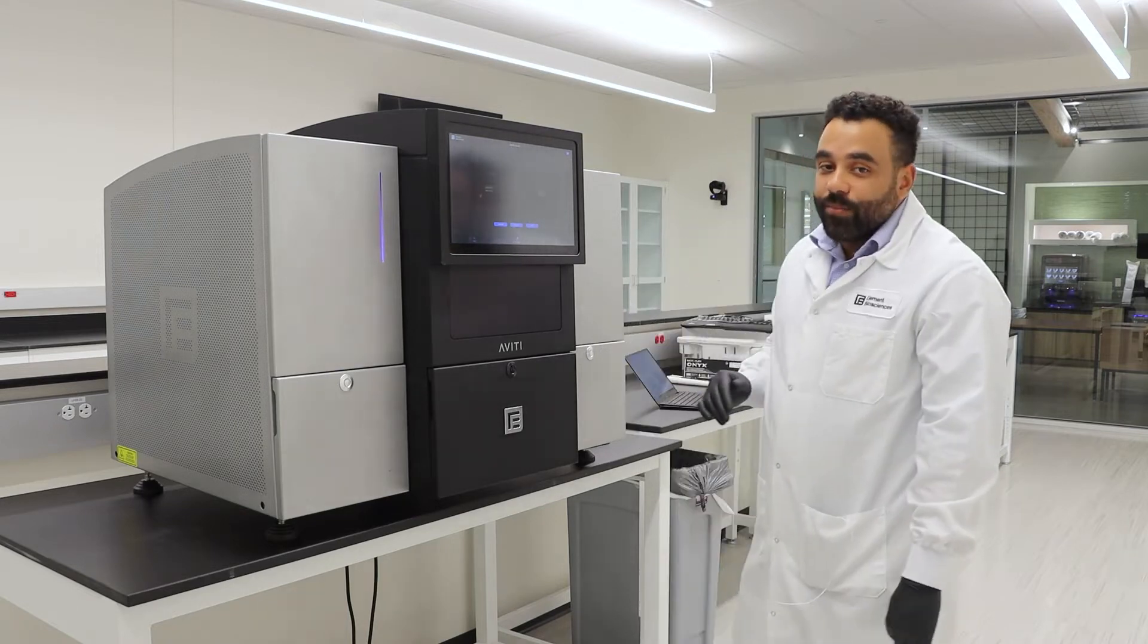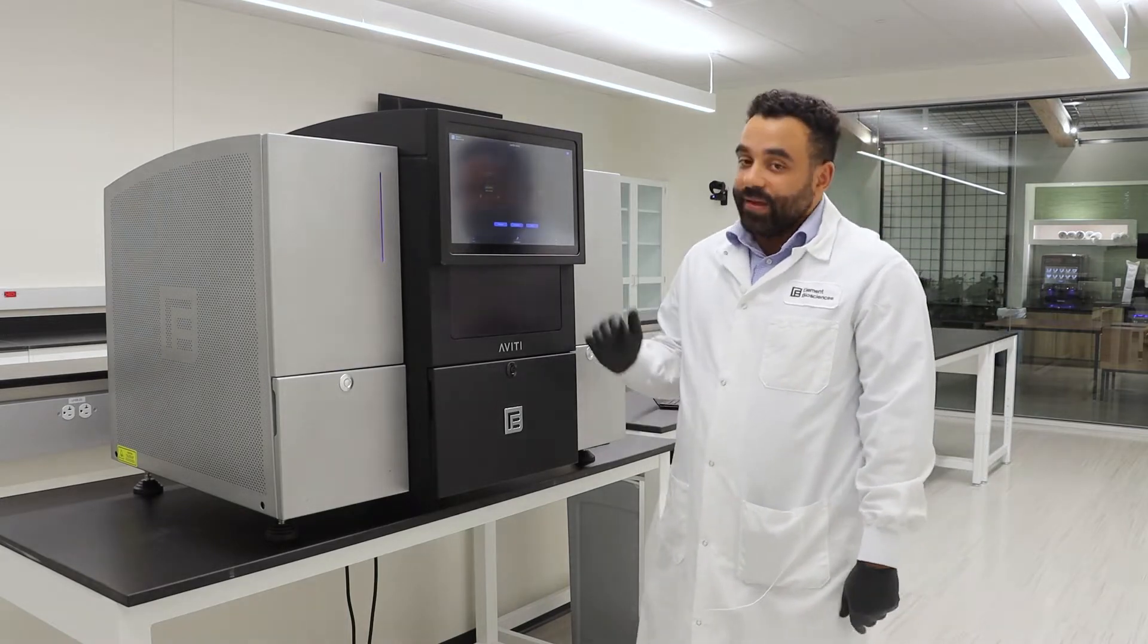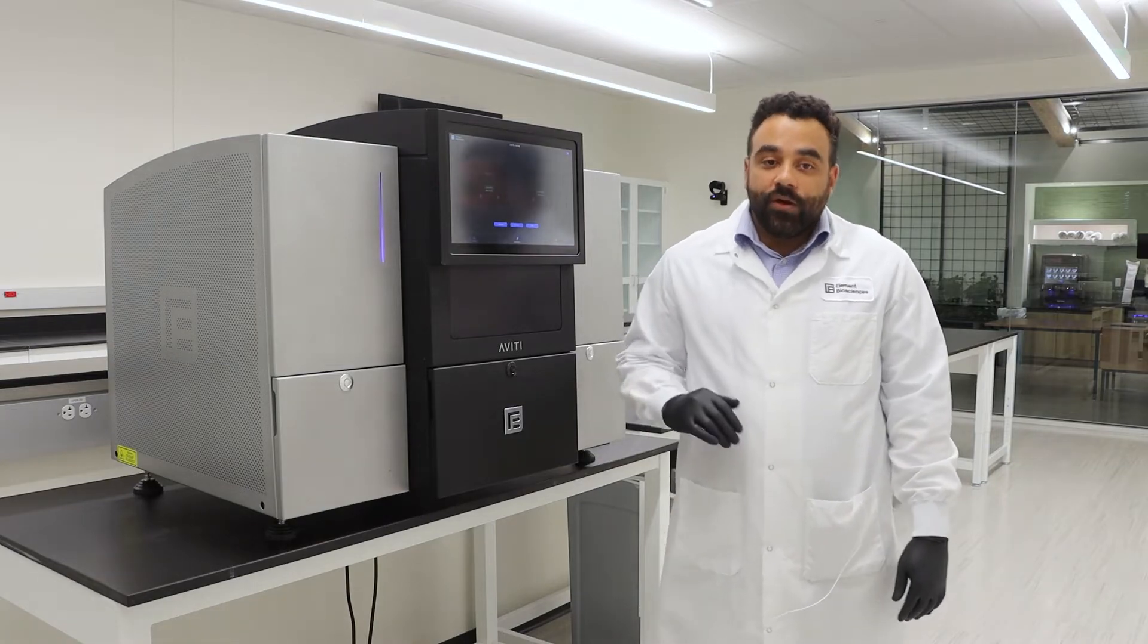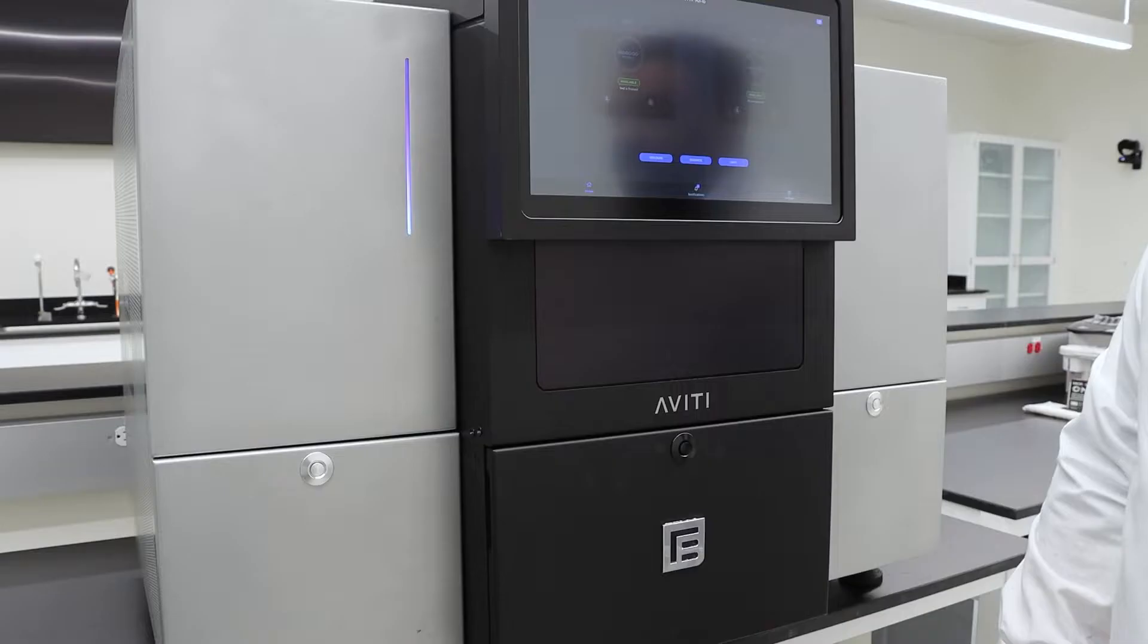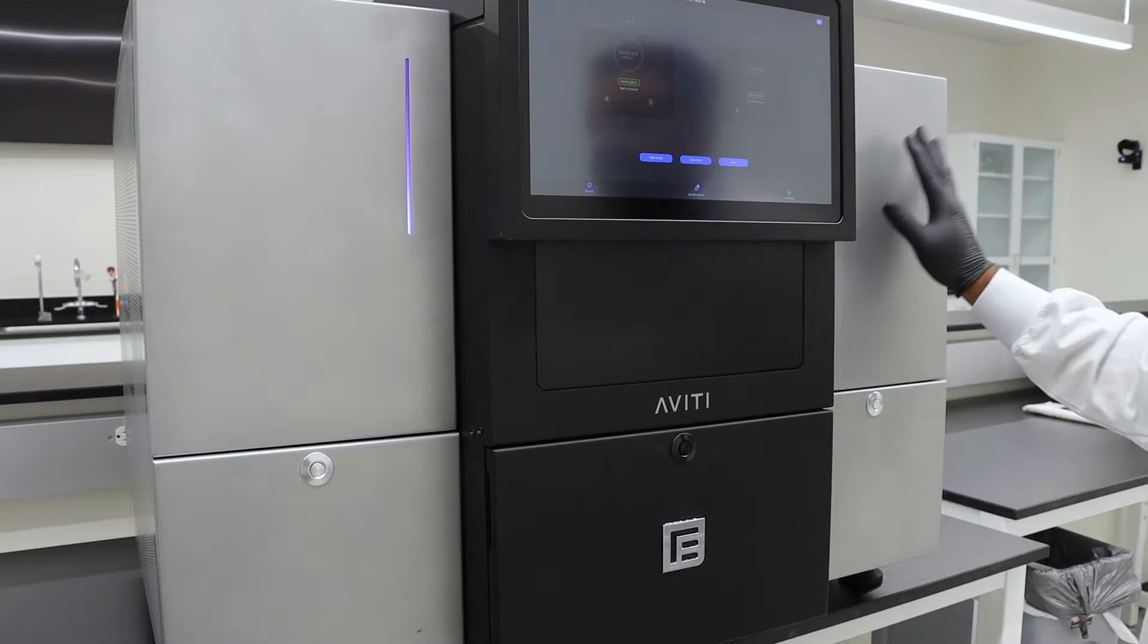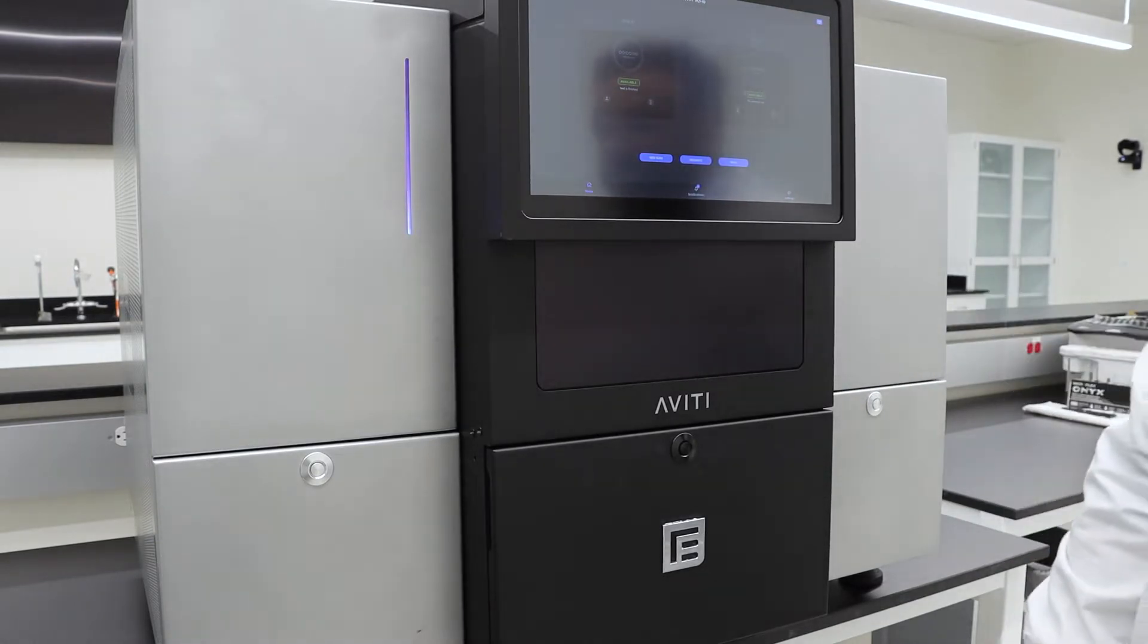One of the most important features of the Aviti system is flexibility and that starts with a dual flow cell design. Each flow cell operates independently so you can start each side whenever you want, which is like having two sequencers in one instrument.